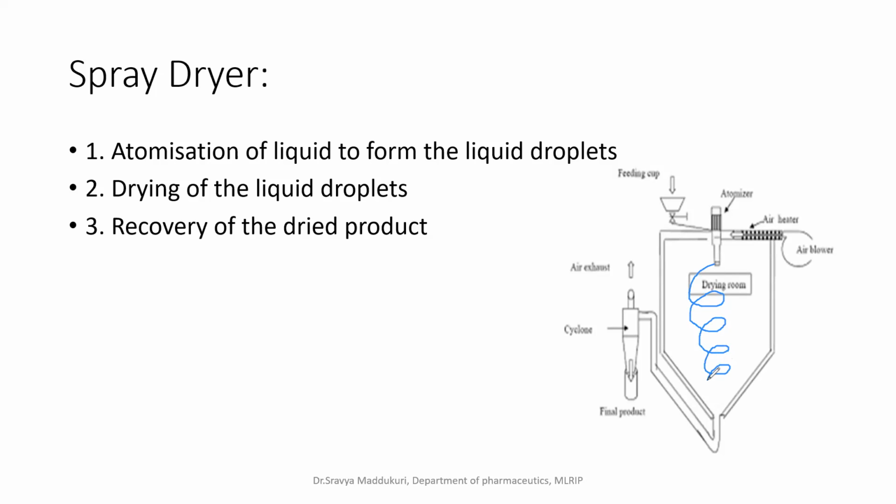So the principle is the continuous transformation of feed from fluid state to particulate form. And the feed is either solution, slurry, emulsion, gel, or paste.